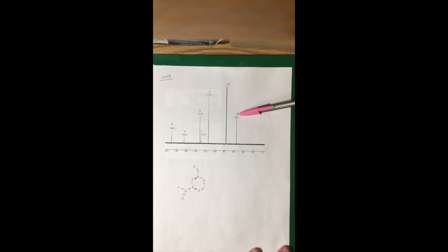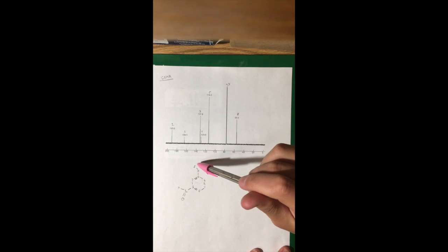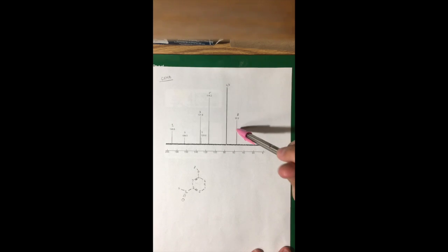And then this 8th carbon is bonded right here to the ether at 55.5. It is just the one CH3 within this molecule, so it's the smallest carbon-based group, I guess. That's why it is shifted least far, or least downfield.